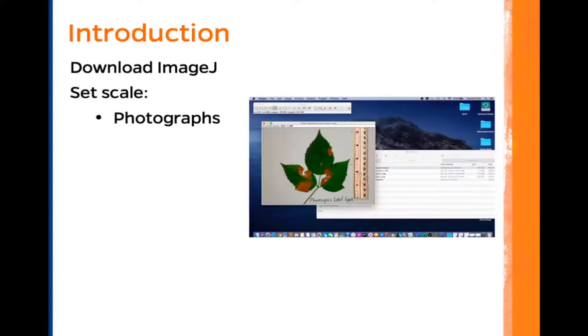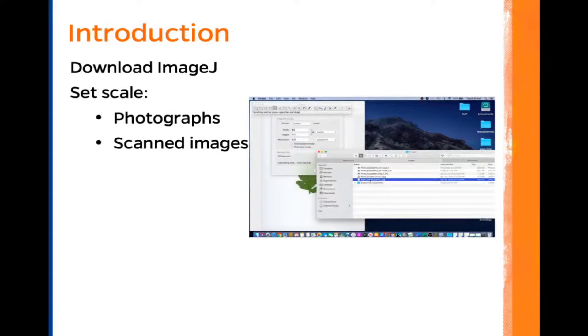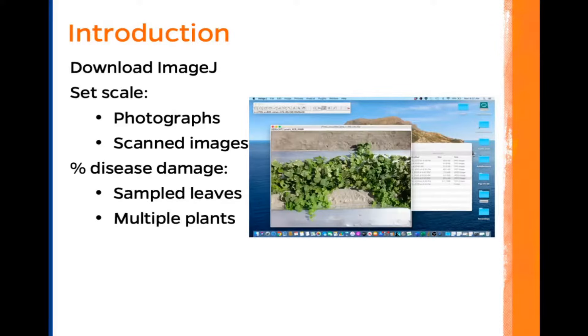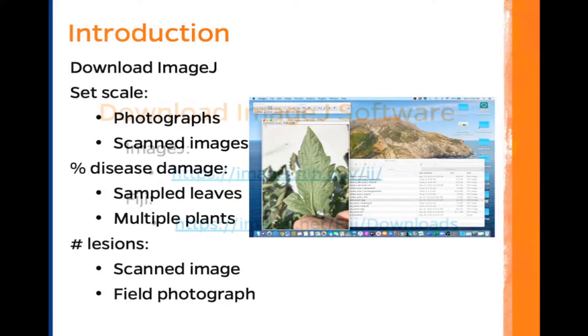In this video tutorial, we will download the ImageJ software. We will set scale for photographs and for scanned images. We will calculate the percentage of disease damage for a few sample leaves and for multiple plants. We will also count the number of lesions on the same leaf from a scanned image and a field photograph.